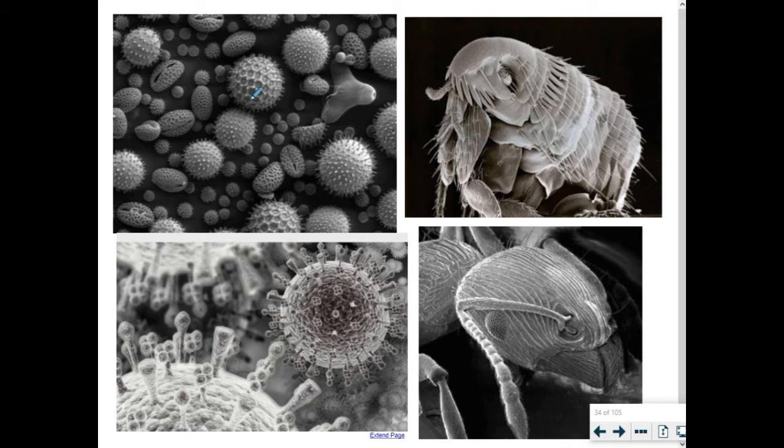But these are viruses. These are germs and bacteria that we're able to see. We can actually see the receptor locations on the edge of this so that we can try to figure out exactly how these viruses bind to cells. So that if we can remove the binding capabilities, we can keep people from getting sick. I mean, it's incredible the detail that we can see with these electron microscopes.